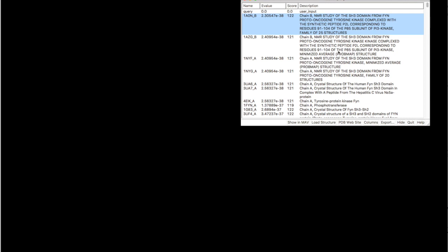Now one has to be careful about choosing the template because the NMR solved structure will produce you the ensemble. And ensembles are not good for modeling. You have to create an average structure of that and then use it manually. So for simplicity of this task right now, we are going to just choose the crystallographic structure.